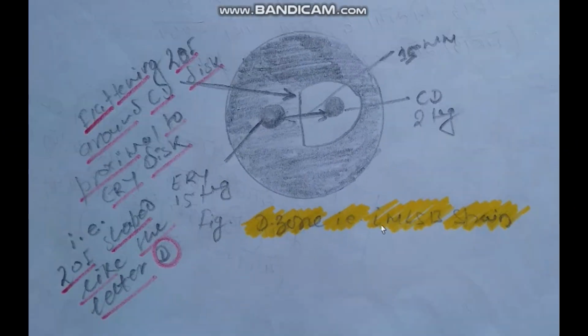Finally, about the D-zone test for iMLSB, that is inducible macrolide lincosamide streptogramin B strain. So how to perform? It's very simple.